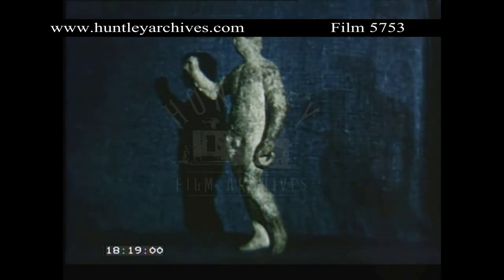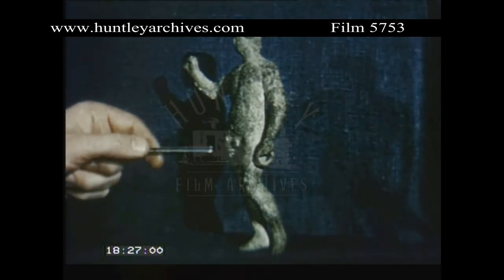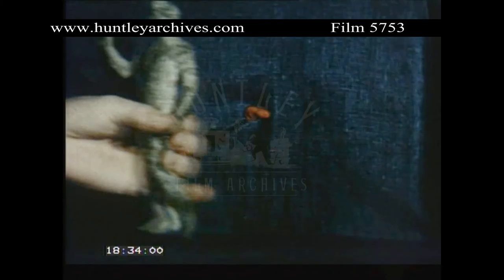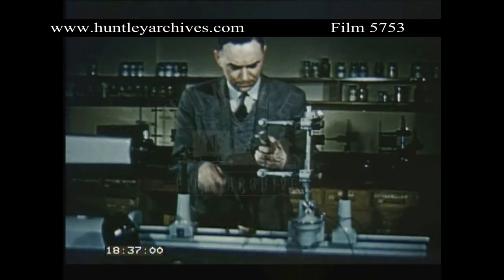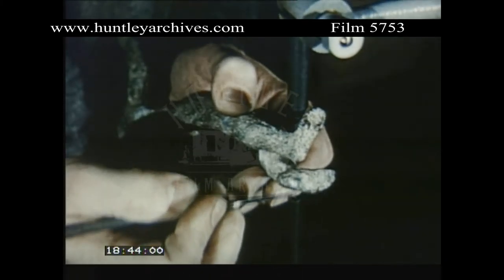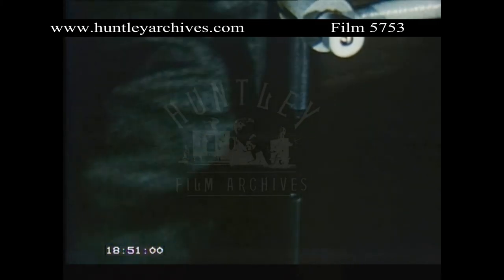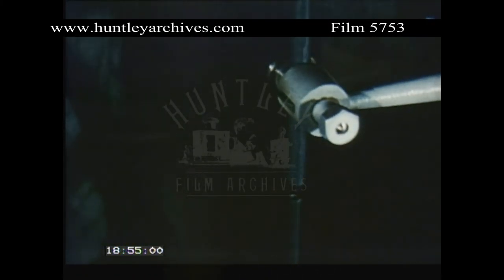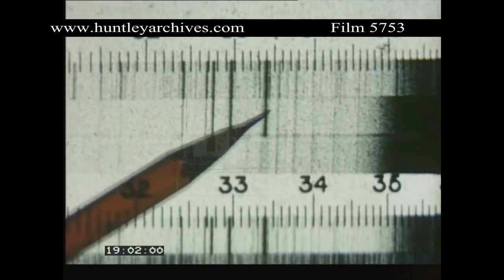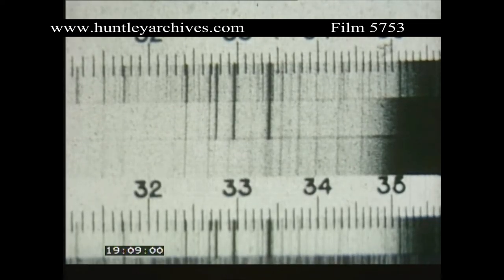Works of art, like criminals, must be assumed innocent until they are proved guilty — assumed genuine until they are proved fakes. This small statue of a Greek god had a surface appearance which made experts doubt whether it really was ancient Greek, dating from 600 B.C. The spectrograph is particularly useful in solving this sort of problem, as it can work with minute samples where other methods would cause serious damage. These tell-tale lines of zinc — never refined before the Renaissance — prove that the statue cannot be more than 500 years old.